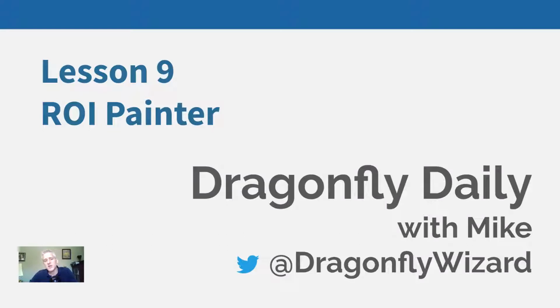We're going to pick up today and talk about ROI Painter, which allows you to do manual curation and editing of segmentations, which can be very powerful and is often required with more demanding segmentation tasks, particularly in biological samples. But you'll see that it gives you a lot of freedom even in non-biological samples. And then in lesson 10, we will turn to some more advanced techniques. We'll put together some of the things we saw in lessons 8 and 9 and some other new features that we haven't seen yet.